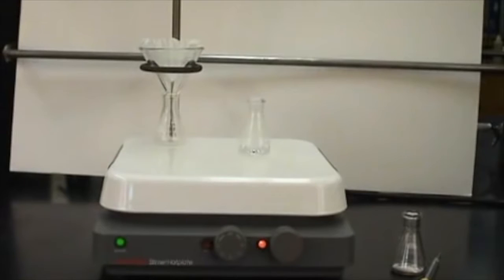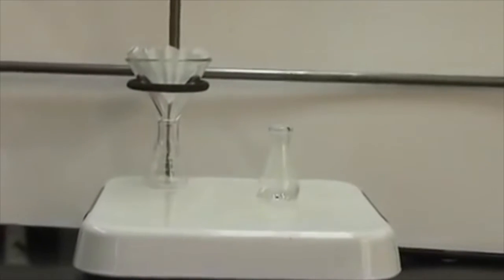Now I'm going to show you how to do the recrystallization of an organic compound. The equipment needed consists of a pipette, a flask containing the compound to be recrystallized, a hot plate, a flask with recrystallizing solvent and boiling chips, and an assembly for doing a hot filtration. This consists of a stemless funnel, some filter paper, and another flask for receiving the filtrate.